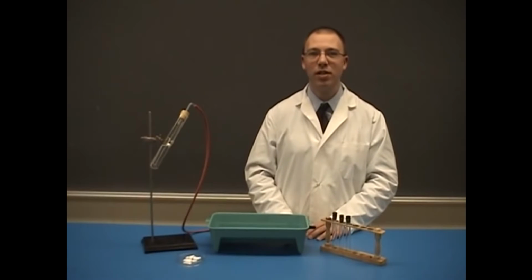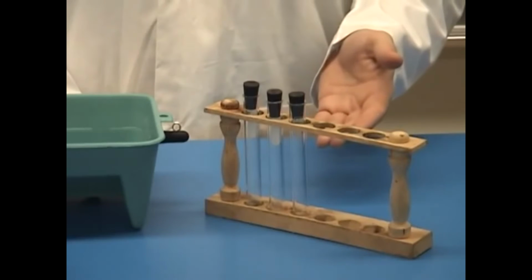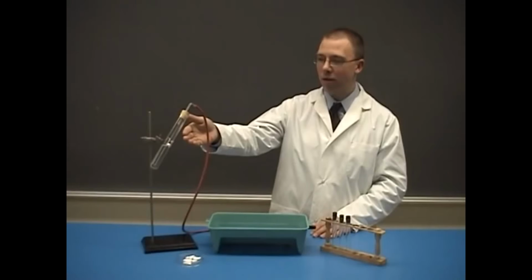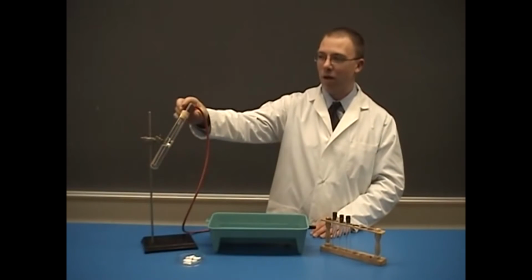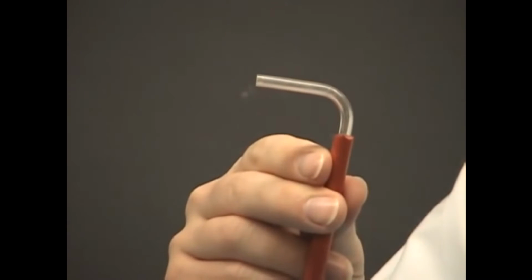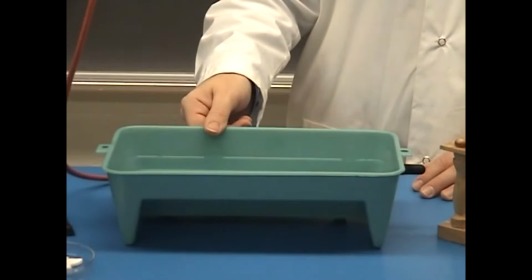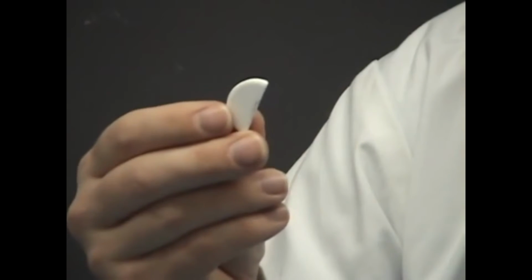The materials that you'll need for this lab are 3 small test tubes, a larger test tube filled with water, supported by a universal support stand, a 1-hole rubber stopper, surgical tubing, and a glass elbow, a trough to collect the gas, already filled with water, and half an Alka-Seltzer tablet.